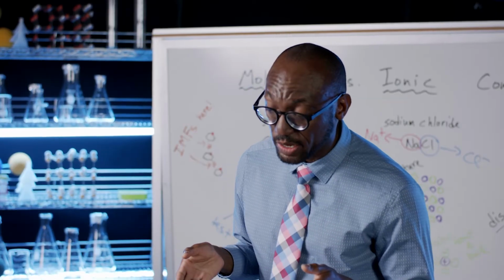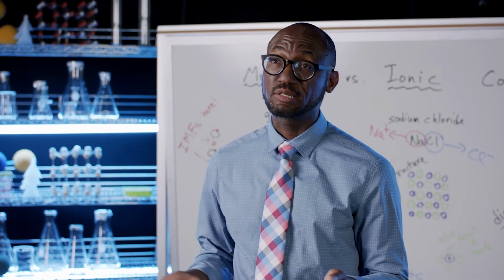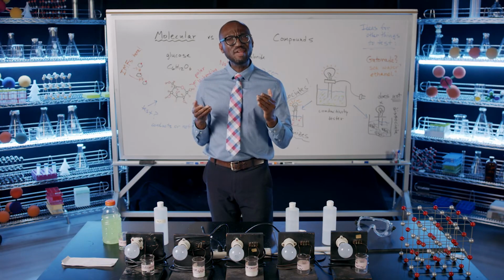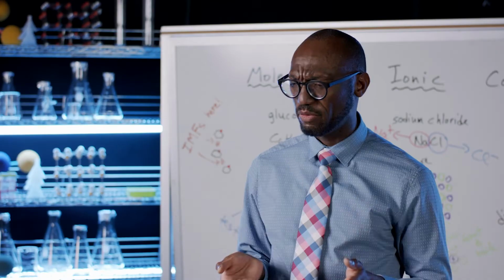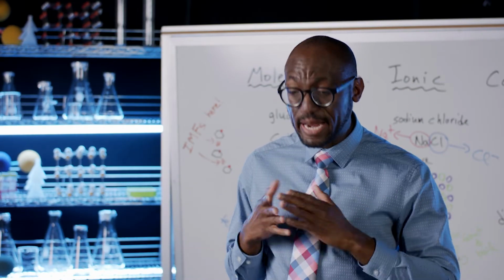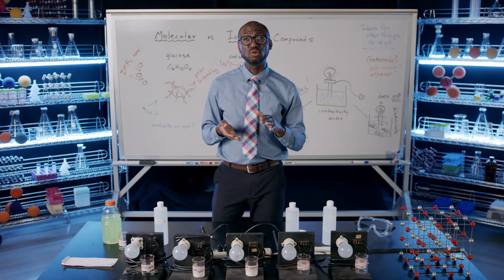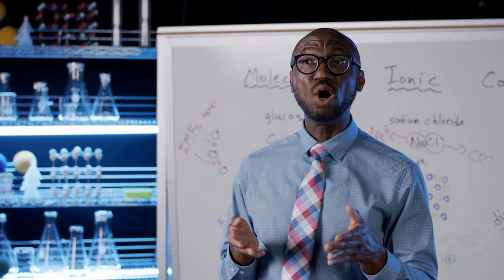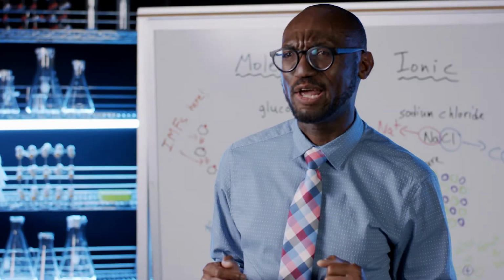I think I'm seeing a trend here: glucose or salt, neither of them conduct electricity. But this doesn't make sense. Sodium chloride consists of charged particles, not neutral molecules like glucose. So what's happening? Why doesn't this conduct? Of course, the ions and molecules are relatively static in the solid. So dissolving the solids in water allows the particles to move around. Maybe, just maybe, this will help.